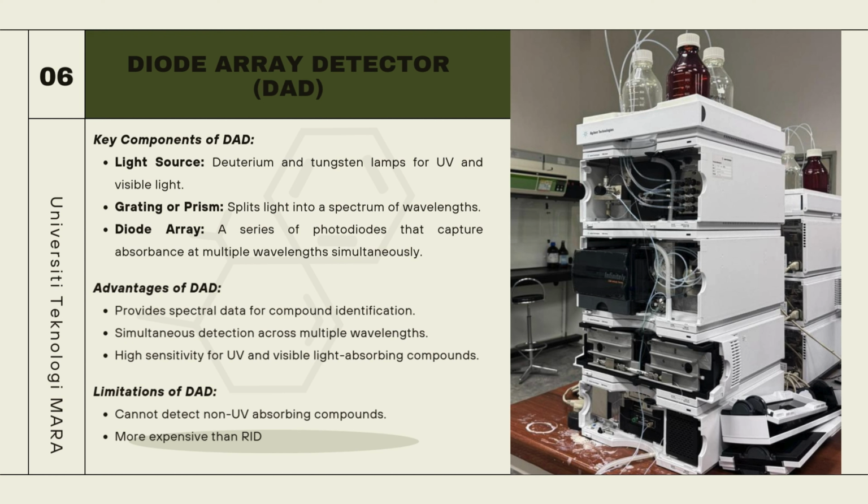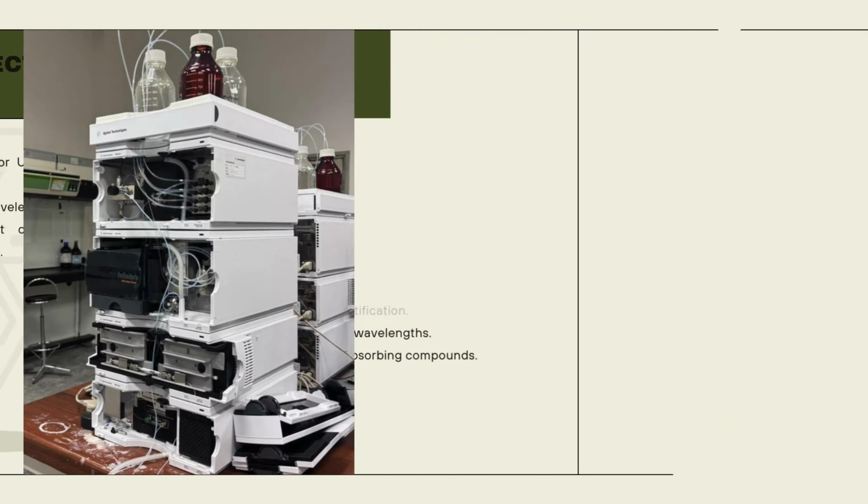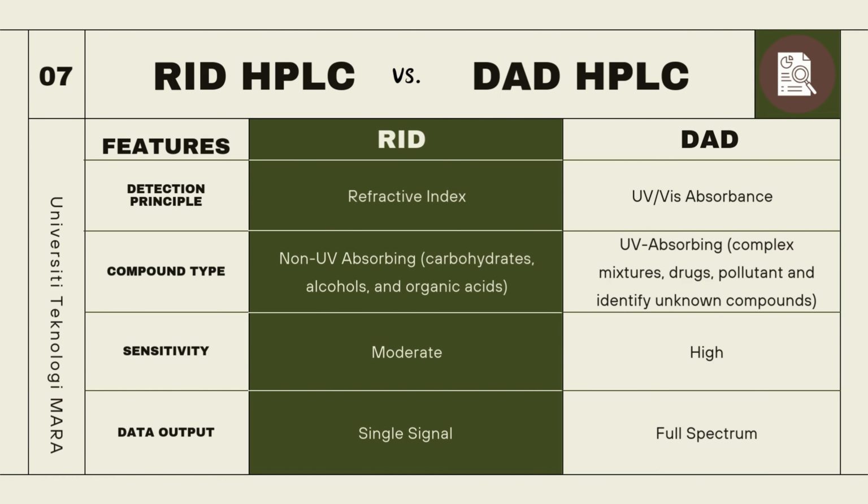Thus, DAD is widely used in pharmaceutical for identifying and quantifying drug compounds, in environmental monitoring for detecting pollutants, and in chemical research for structural analysis and impurity profiling. So, the table below shows the differences between refractive index detectors and diode array detectors.